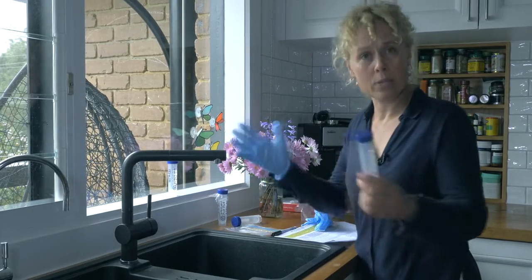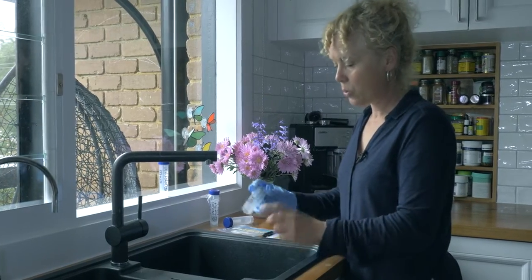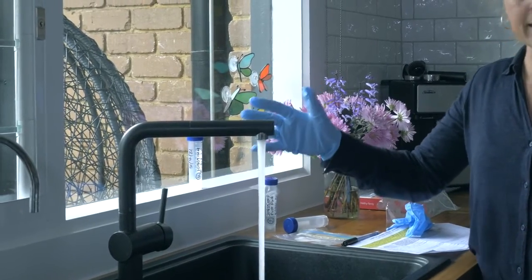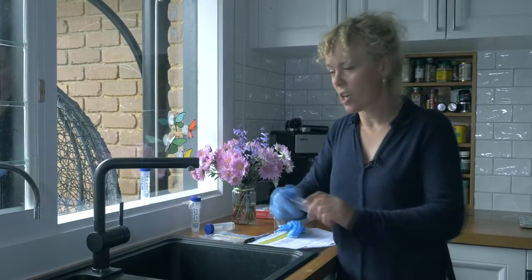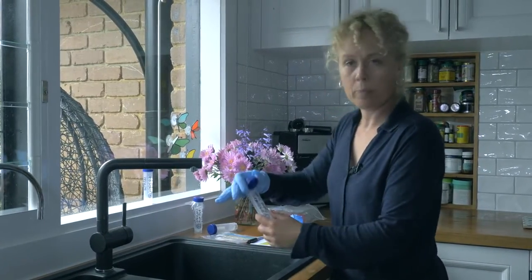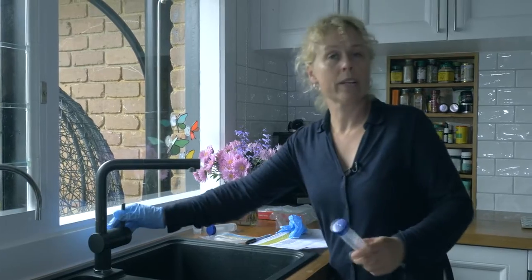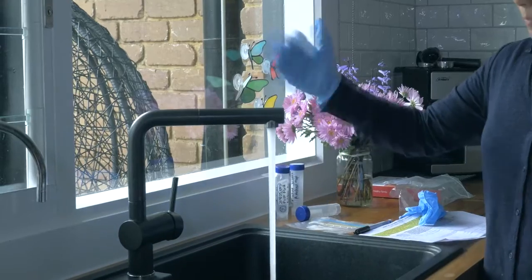The next two samples are up to you, but if I want to check what's in the domestic pipes, I would do a flushed sample. So I would run this for at least 30 seconds and time it for 30 seconds. Once it's gone for 30 seconds, I would then take another sample right up to the top. Again, put a plastic over the top, which is provided with the lab, and do that. Then I would run it for another 2.5 minutes, so it's run for 3 minutes.